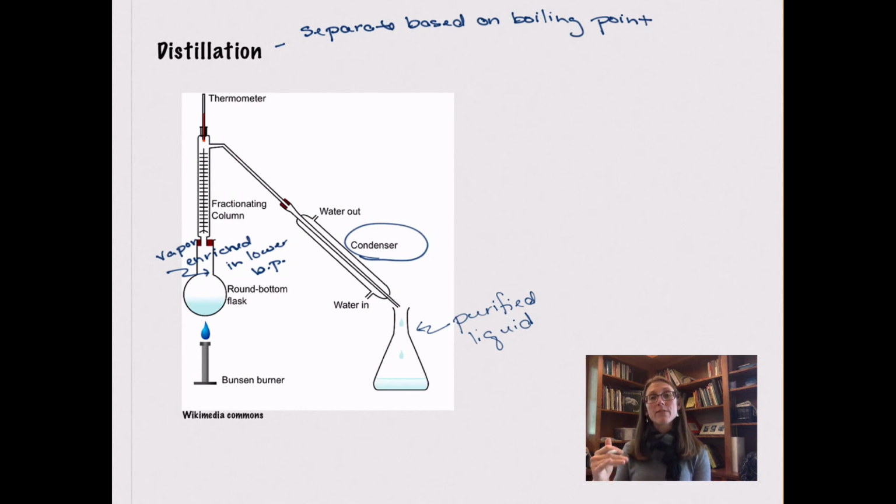And then once all of that lower boiling component, or the vast majority of it, has been removed, you'll tell, because the temperature will start to shoot up again and rise until you reach the boiling point of your higher boiling component, where again you'll hit a plateau. And so distillation is a really nice way, if you have two volatile liquids, you can separate them based upon their boiling points.